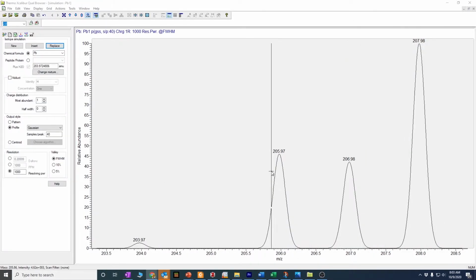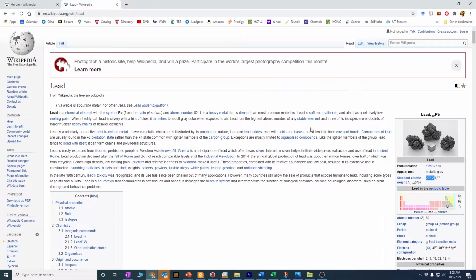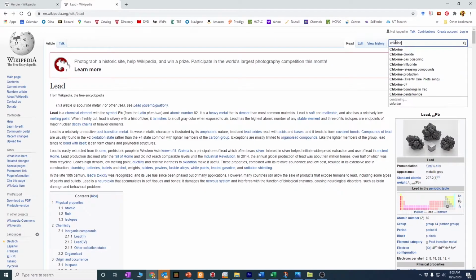And that is, in fact, what we see. Two peaks that are about the same size. This one's a little bit smaller. And then a peak that is about double intensity of those two at 208. So these are those isotope peaks. And we dealt with this. You did this in general chemistry. I know those are famous words that you do not want to hear, notorious words.